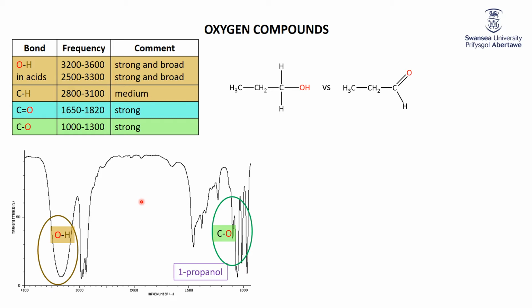About half the time when one's looking at an infrared spectrum, one is interested in what is there. But a lot of the time you're also interested in what is not there. And in particular, as you see more and more of these spectra, the first place your eyes will go to is this middle bit right around here. And you'll see, well, there's nothing right there. Well, what do I mean by that?